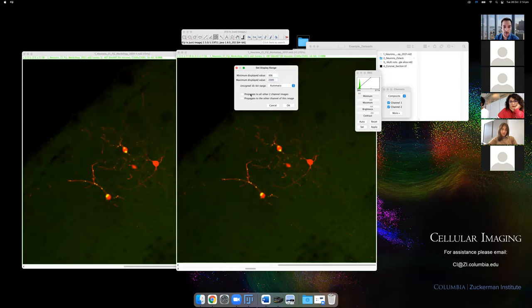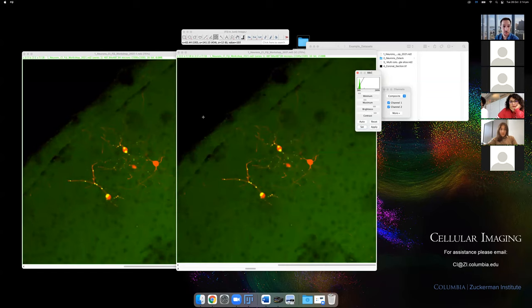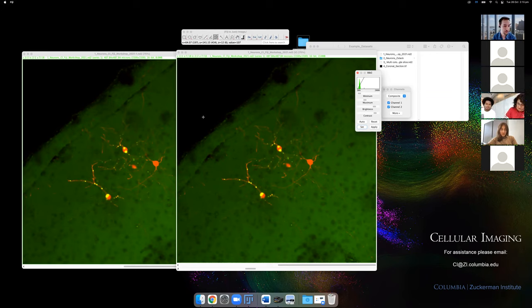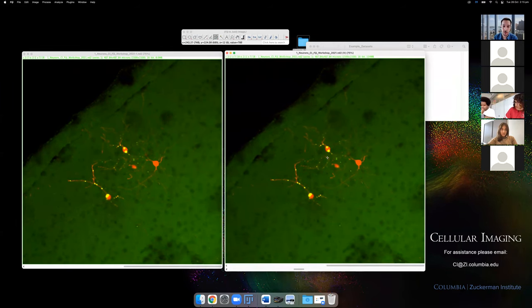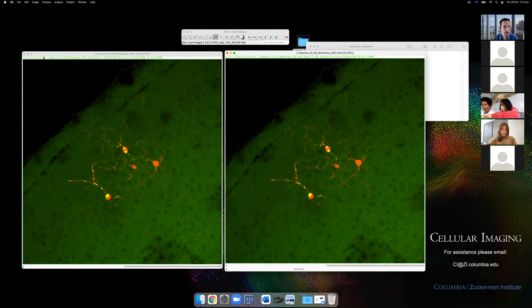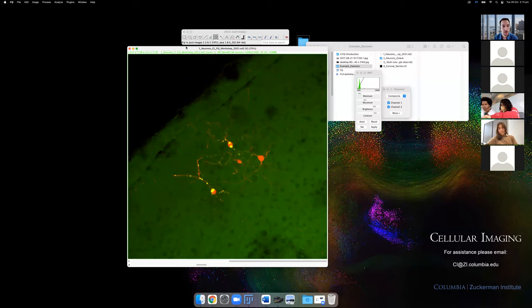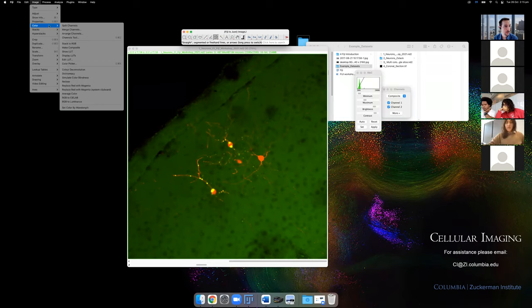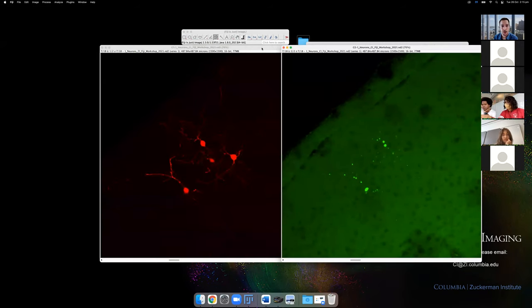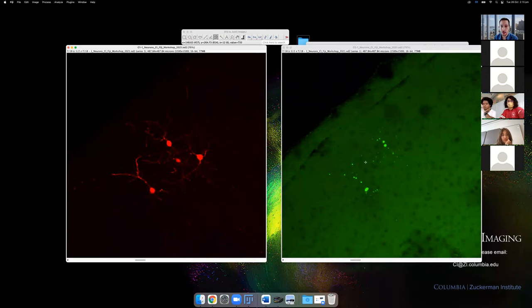You can propagate these settings so you're looking at all images consistently. If things are ambiguous — like whether spots are inside a particular cell — a really useful tool is to split the channels and use the Synchronize Windows function under Analyze > Tools. This lets you look at two channels side by side and scroll together to confirm visually whether a spot is inside a given cell.